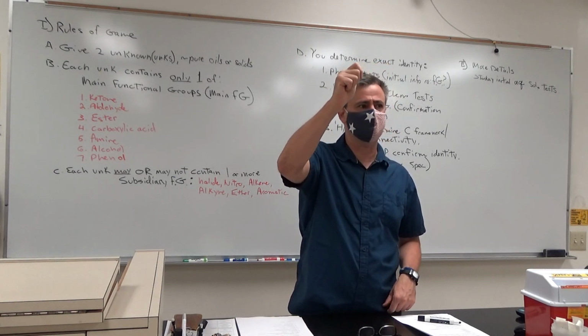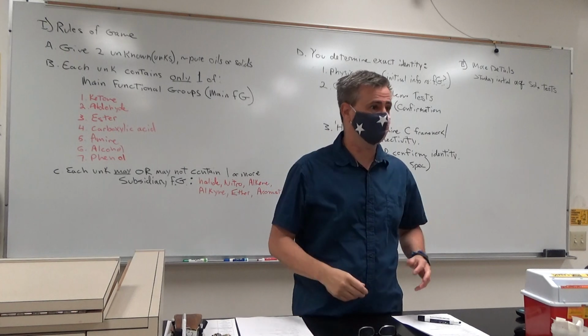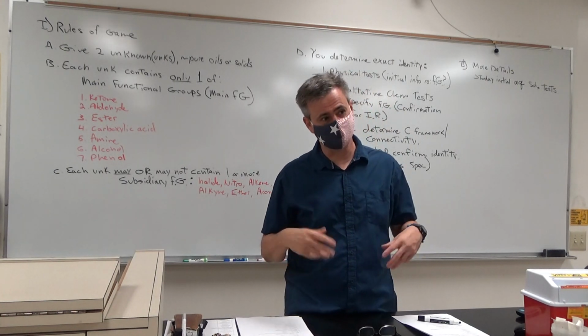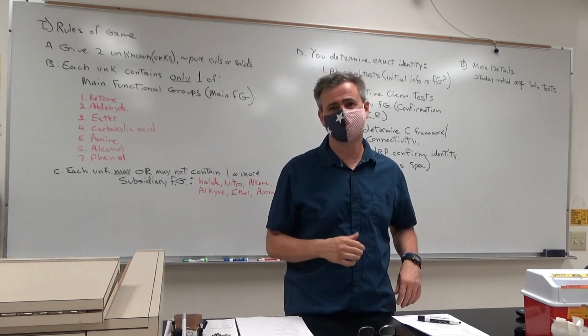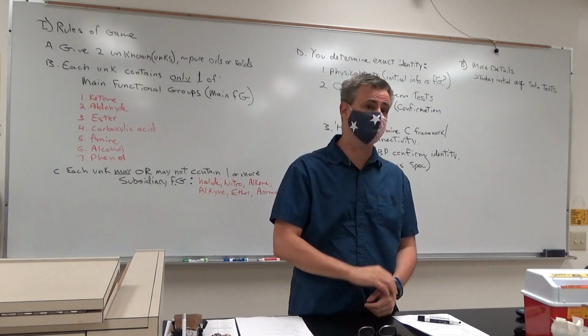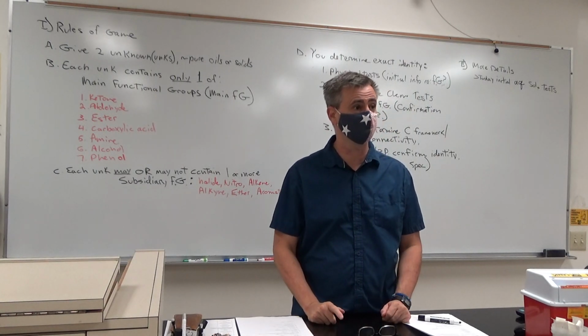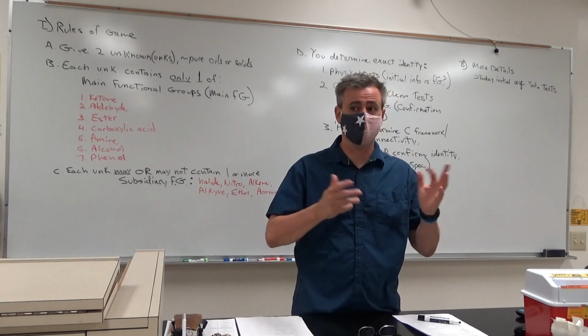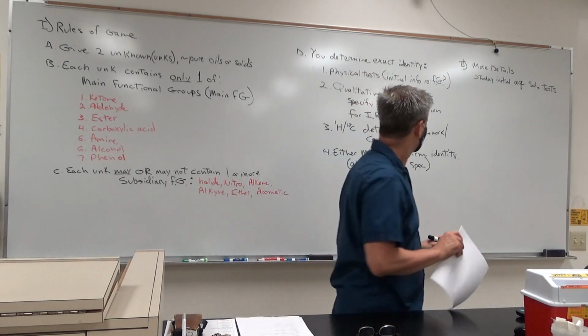Does this look right for a positive iodoform test? I'll say, what did the standard look like? Half the time, nobody had the standard. Go do it for the methyl ketone back there, I think it's acetophenone, and that'll tell you roughly what it's supposed to look like.